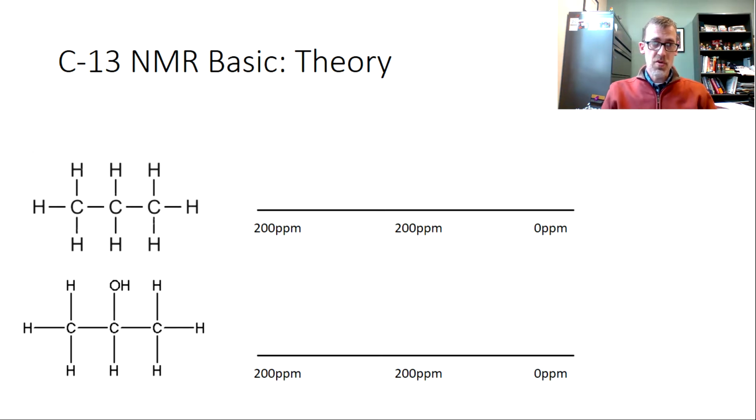First of all, let me describe NMR is a type of spectroscopy. So it's in the category or family of instruments that are using electromagnetic radiation and interacting that with material. As a little bit of a refresher, maybe from first semester, UV and visible light has enough energy to excite electrons. So visible light can excite electrons. We see that perceived as colors. UV light can have enough energy to actually eject or ionize, knock electrons off of molecules, and that's the damage that can be caused by UV radiation.